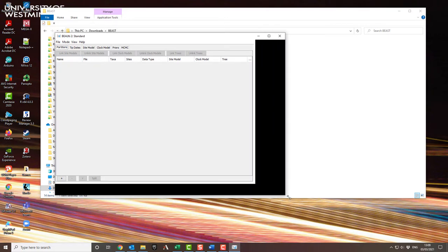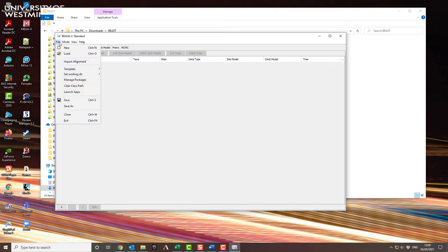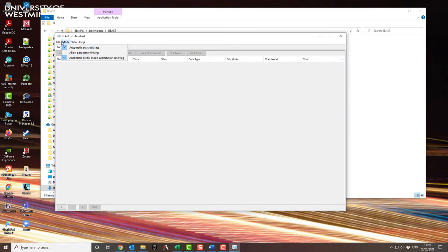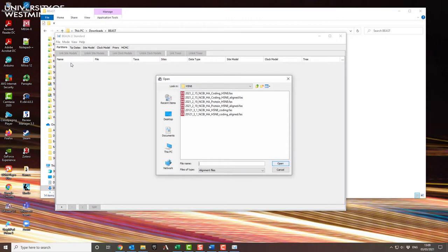So if I go back to what we actually need, I'll go to the file menu and import alignment. Here, I'm going to use a file that I aligned previously using FASTA.